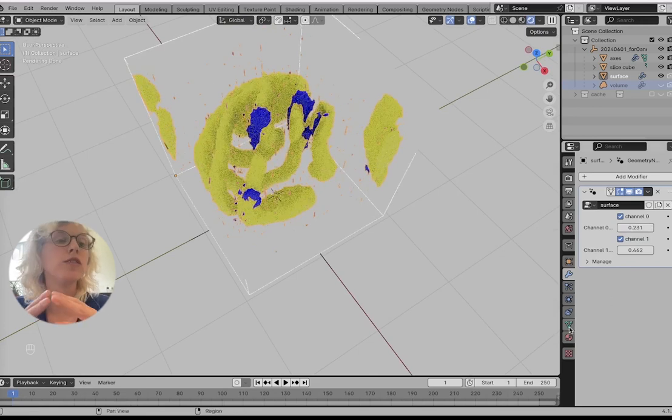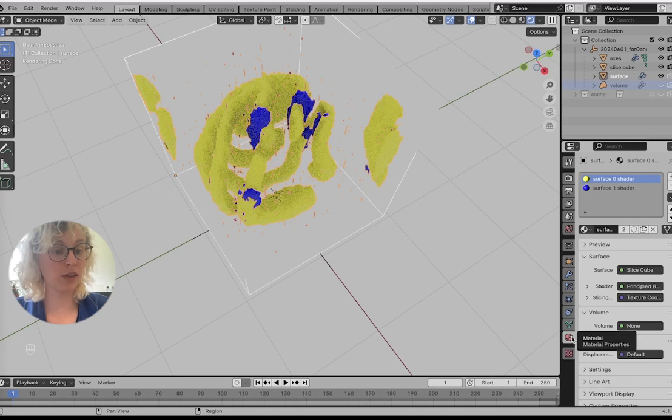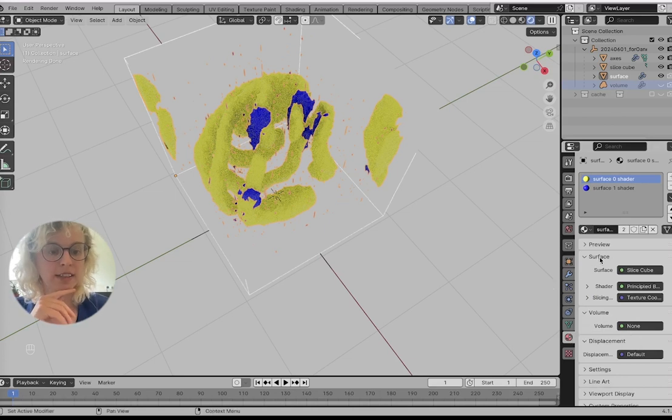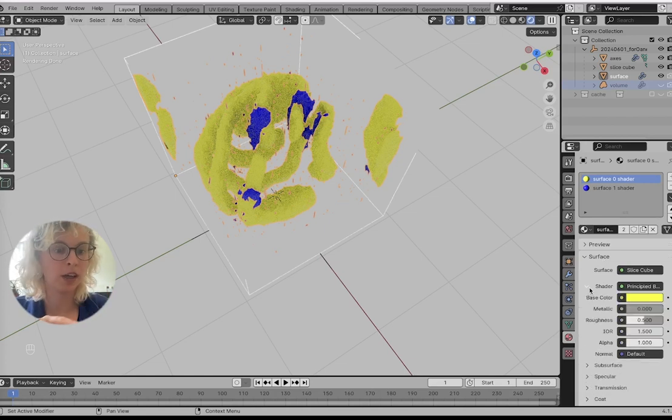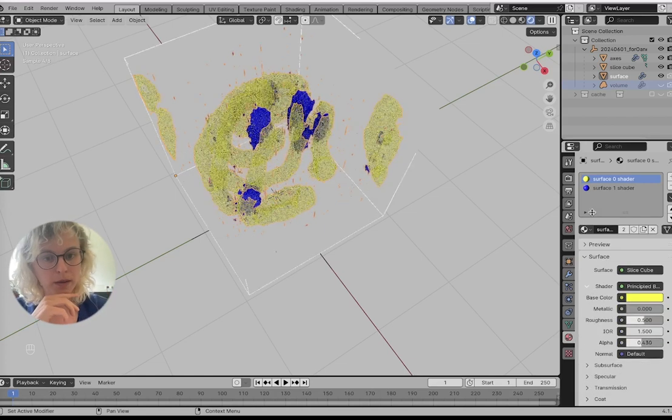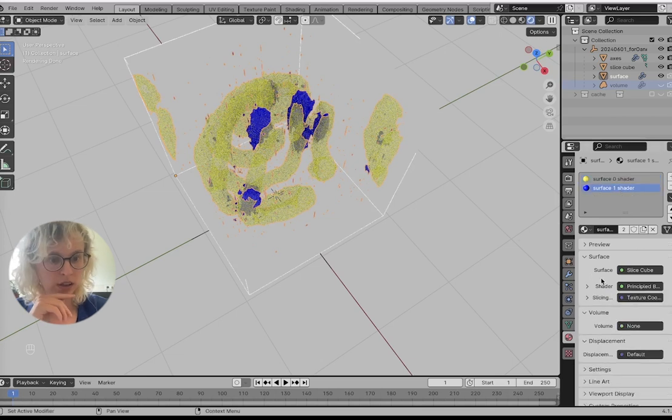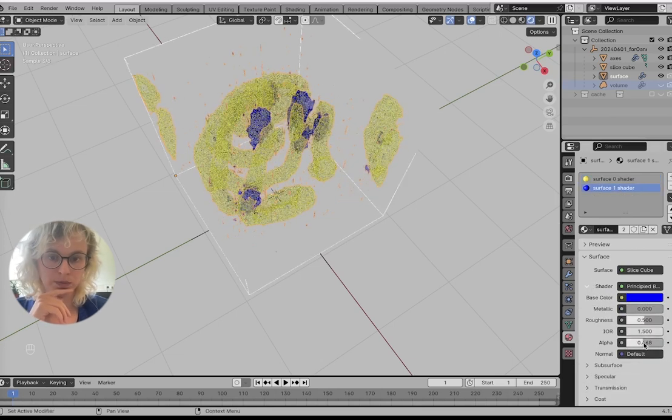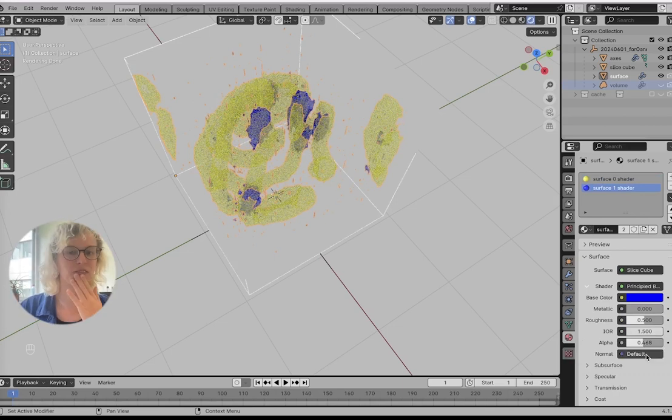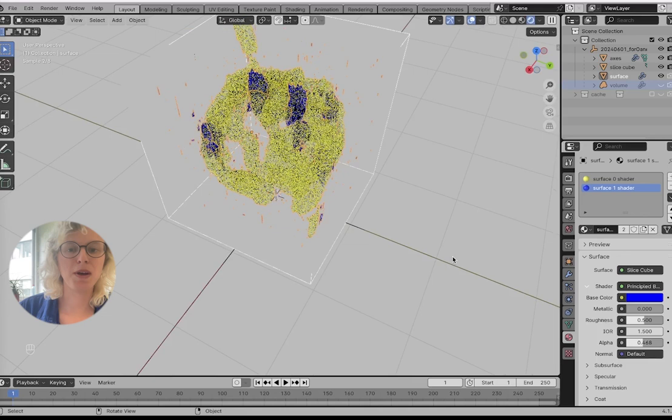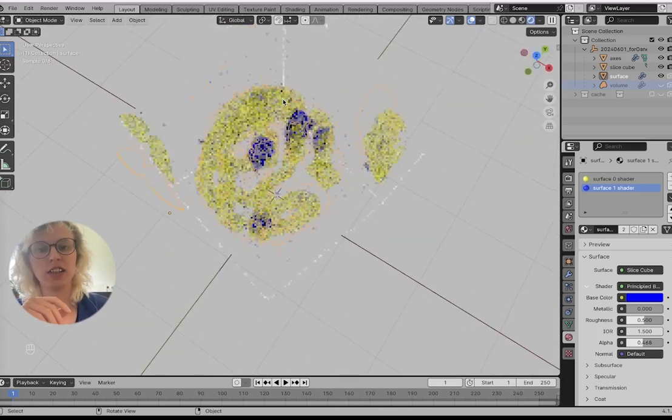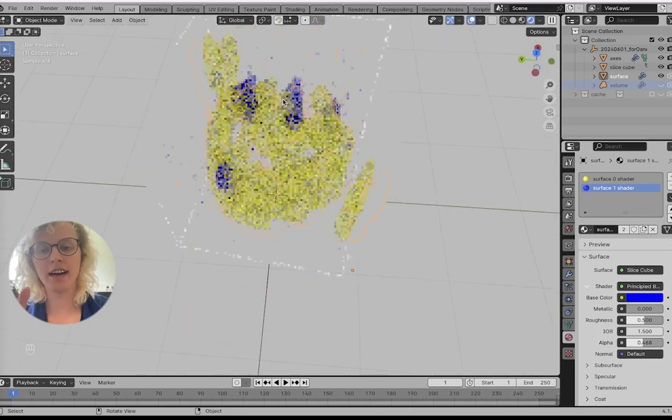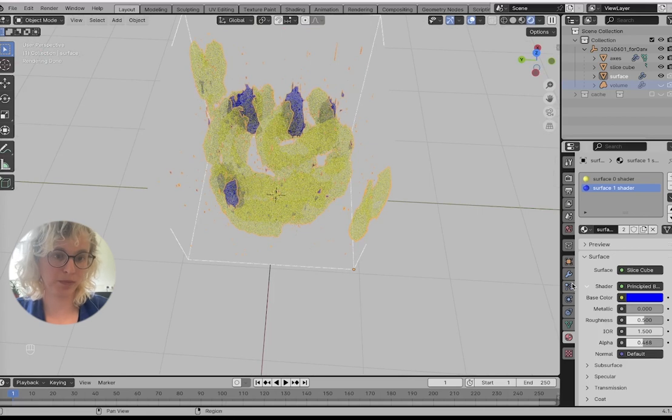We have materials, shaders for each of these channels. But instead of them being in the volume, they're under surface because they're surfaces. Here we can, for example, make them more transparent or even render them as if they're glass or something like this. But this is often a bit much for actually showing data.